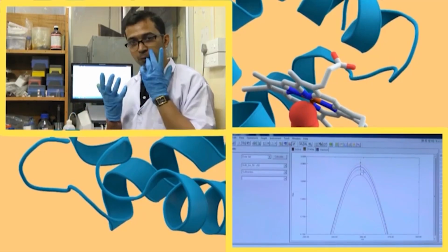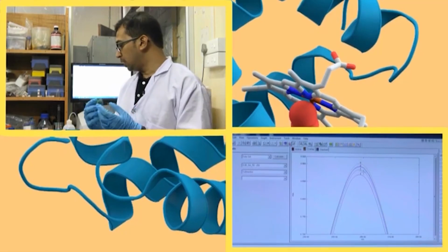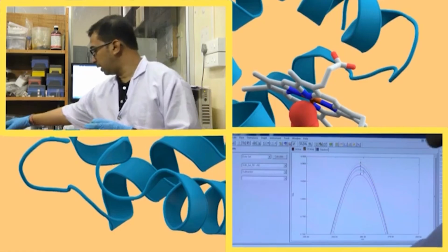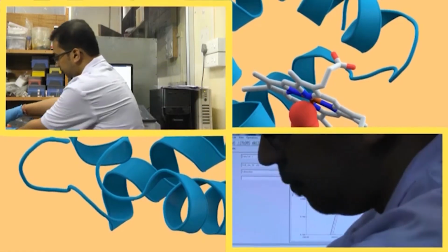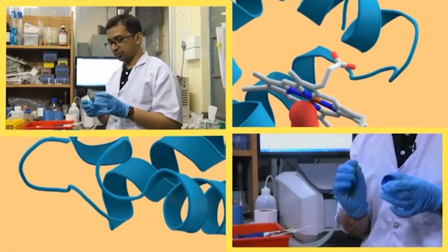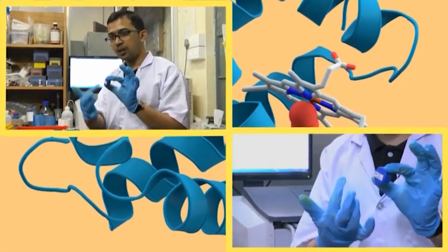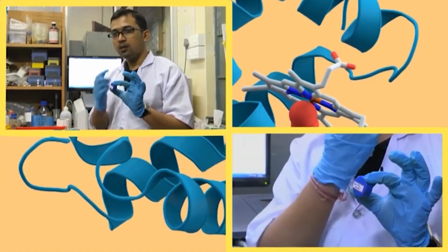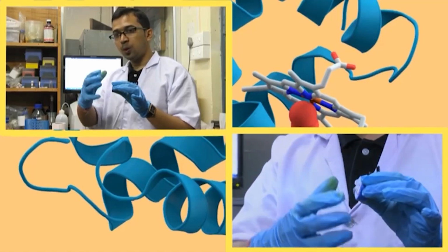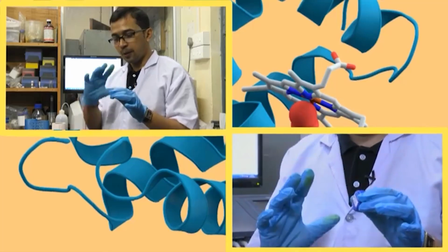Because when a molecule is exposed to the incident light, it absorbs this incident light. If I give you a small example out here, suppose this is a molecule. This is a cap of the falcon, and the molecule shows a UV absorption. The absorption is shown in the region around 260, as in gallic acid. This is just for gallic acid in this region.